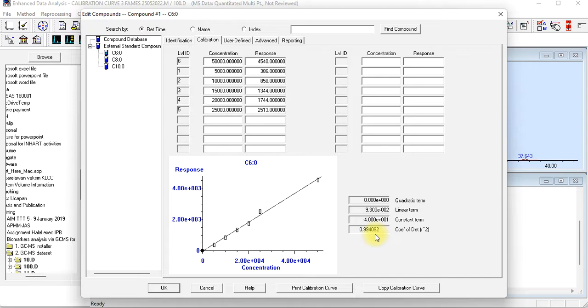Okay. So again, at least I have spread the advanced level to Malaysia's graduates and also lecturers. We have to move higher than others. Okay. So just put the blank. Even if you want to put level S7 it is okay as well, no problem. Because the blank will become 0, so the calibration still appears. Just put 0. If you can run a blank and then introduce it, update it as a 0 concentration.